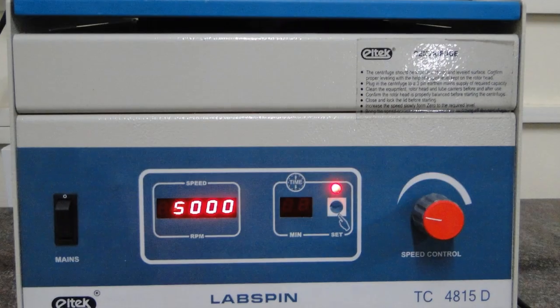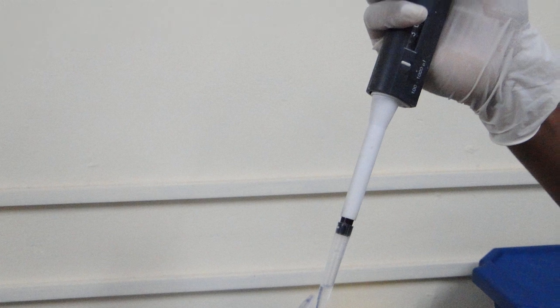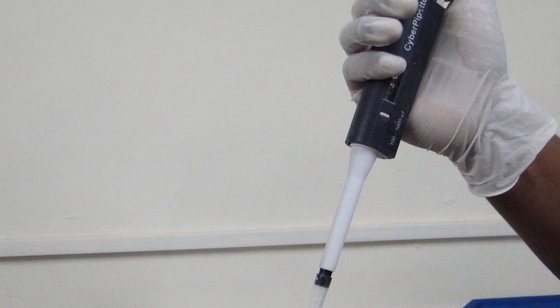Centrifuge it at 5000 RPM for 10 minutes. Transfer 300 microliters of the supernatant without disturbing the pellet to a new vial.